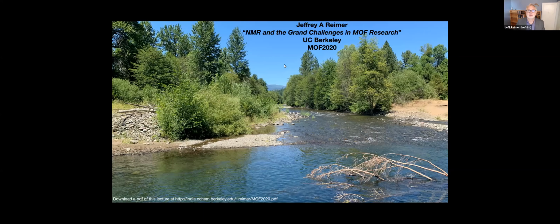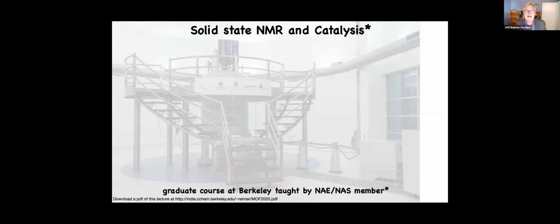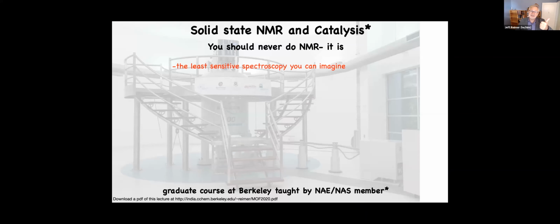So let's go to the classroom for a moment. Let's go to a graduate course on catalysis. It's taught by a member of 2 national academies. And in the context of that course, our colleague asked the question, should you do NMR? And his response is, you should never do NMR. Why? Because it is the least sensitive spectroscopy you can imagine.